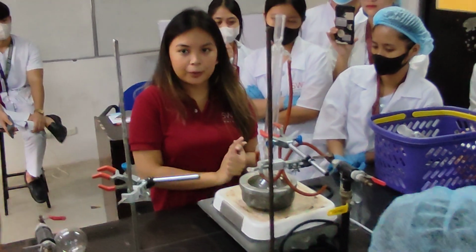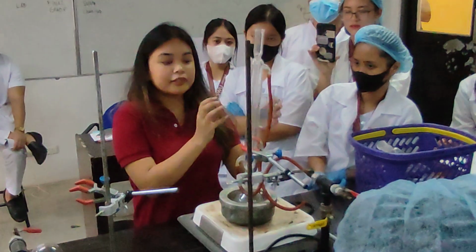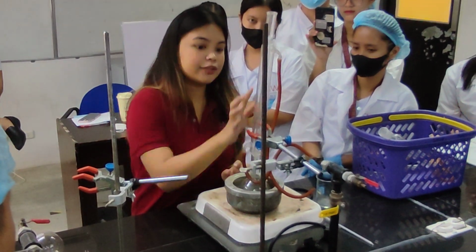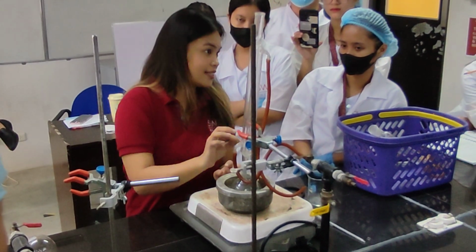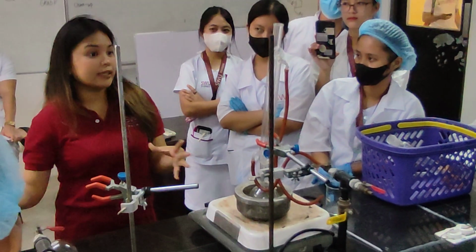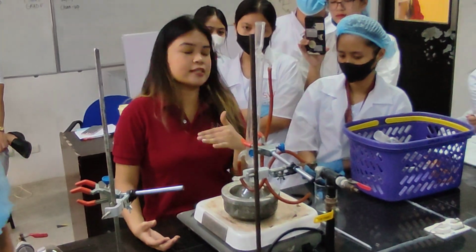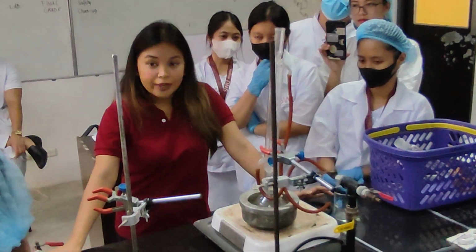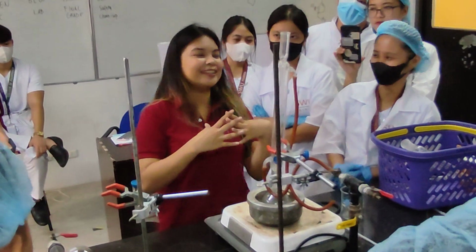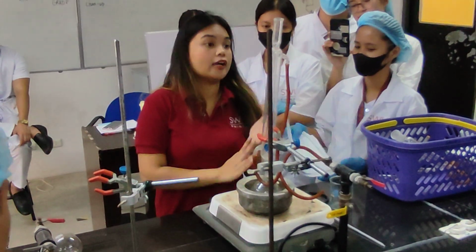For example, you're given 3 hours. After 3 hours, the solvent would be gone. But in your reflux heating, it will maintain your solvent. So the vapor goes up, condenses, the water returns and drips back down. Earlier, the distillation setup was to separate. This one is for you to observe a complete reaction with a solute, especially if organic substances require heating over a longer period of hours. So earlier was purification. This one is for long heating, observation of a complete reaction that requires heat.